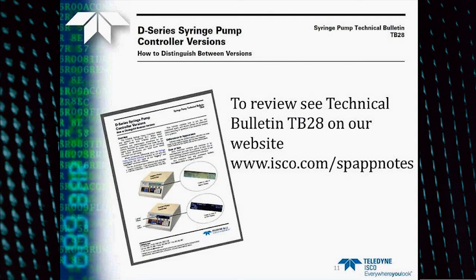So to review this process, you can go to our website, www.isco.com, and /SP app notes would get you right to the page where you can find this app note. It's technical bulletin number 28 that describes in detail how to identify your controller.